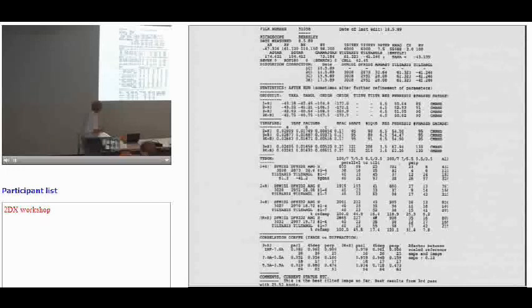But as we learn about the defocus, and you can see it's being changed slightly, and you learn about the unbending and so on, it goes up from 25 to 41 to 43 to 47, 23, 27, 26, 20. So, 8, 13, and then 16. And then we stop here.